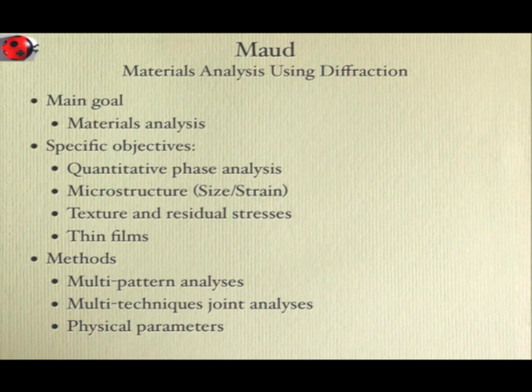It's based on the Rietveld method, but not only. Normally what we use is multi-pattern analysis, so one analysis can deal with one pattern or several patterns. We join several kinds of analysis from neutron, electron, or X-ray diffraction, and there are several Rietveld programs that do that, but we are also combining different techniques. For example, reflectivity with XRD, which is quite good for thin film, and we are also working a lot now on XRF and others, okay?